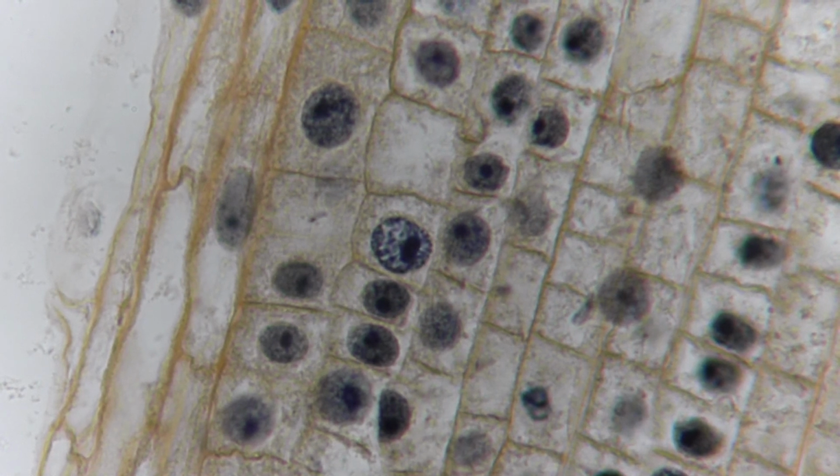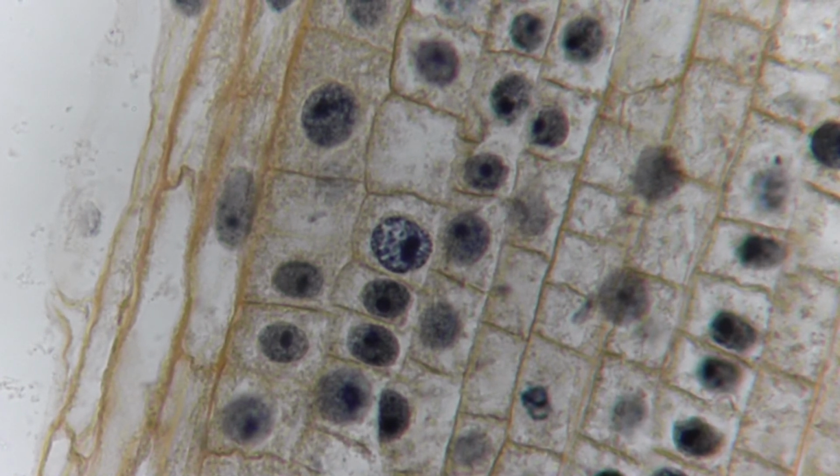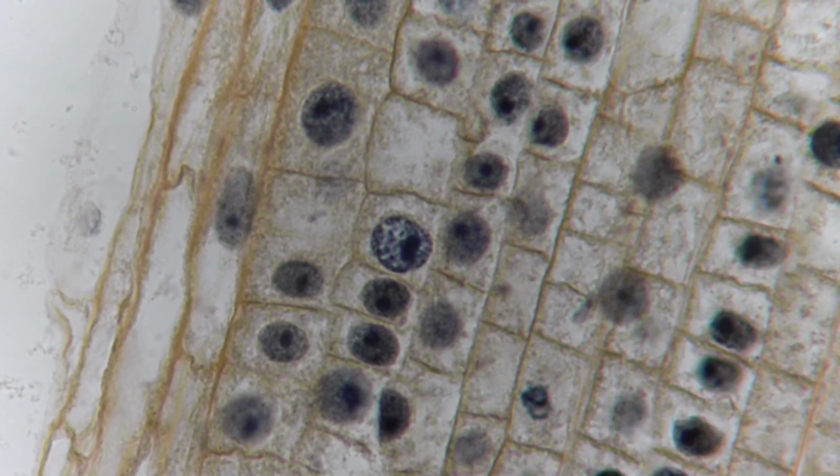You see the telophase that's up at the top, and then you have the two identical same size cells right below that telophase that are smaller than the cells up above it, to the left and to the right. And that's just two baby interphases.